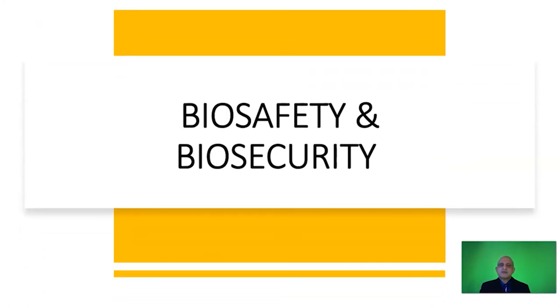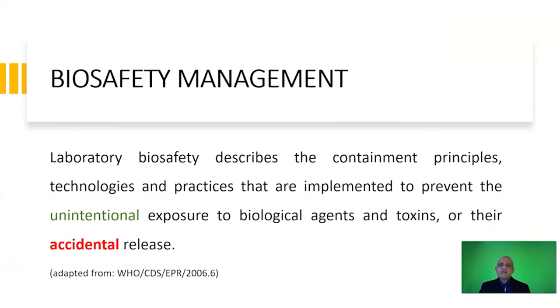The first terms which you need to understand are biosafety and biosecurity. And this is a management term. In biosafety management, we focus on mitigating the risk posed by the accidental release of a pathogen from a laboratory or a containment facility. And biosafety management fundamentally describes the containment principles, technologies, and practices that are implemented to prevent the unintentional exposure to biological agents and toxins or their accidental release. This is a very specific definition which is adapted from the World Health Organization Laboratory Biosafety Manual. So the key principle is unintentional.